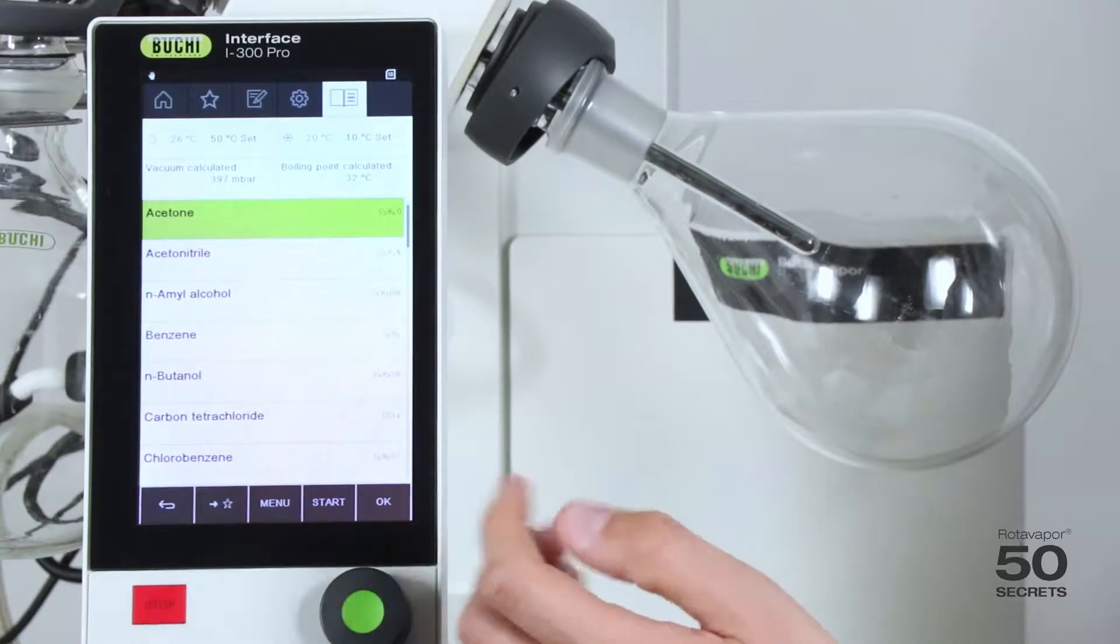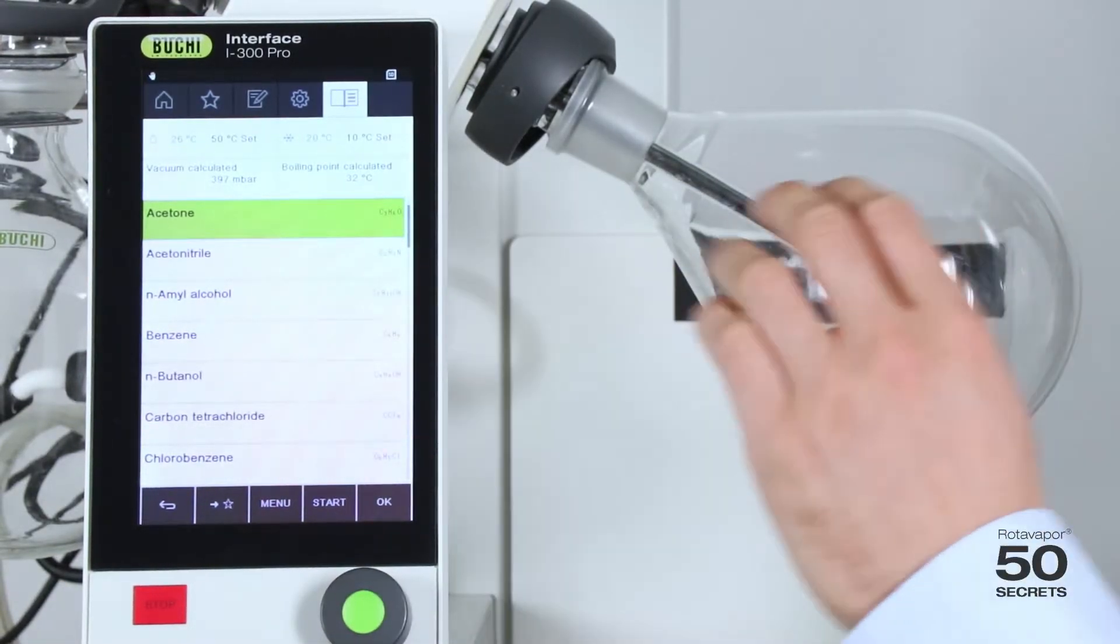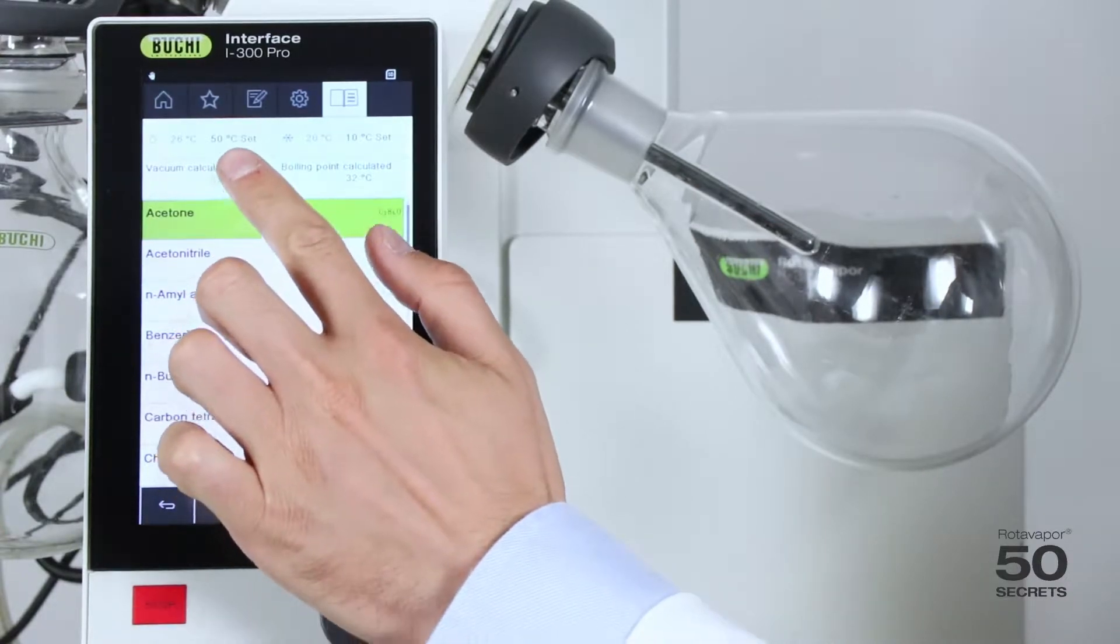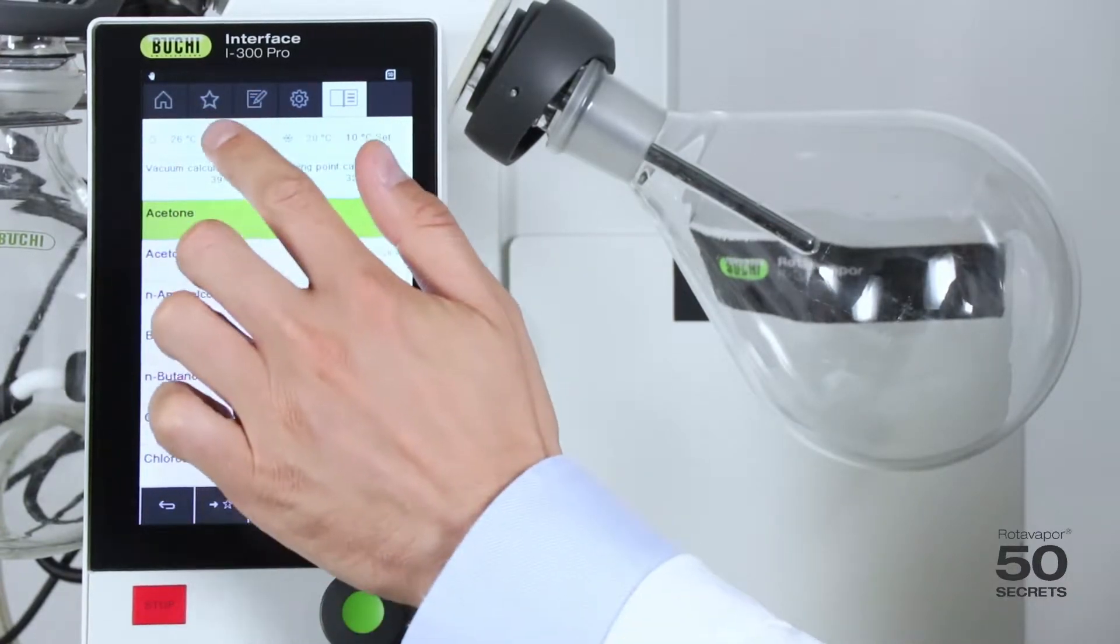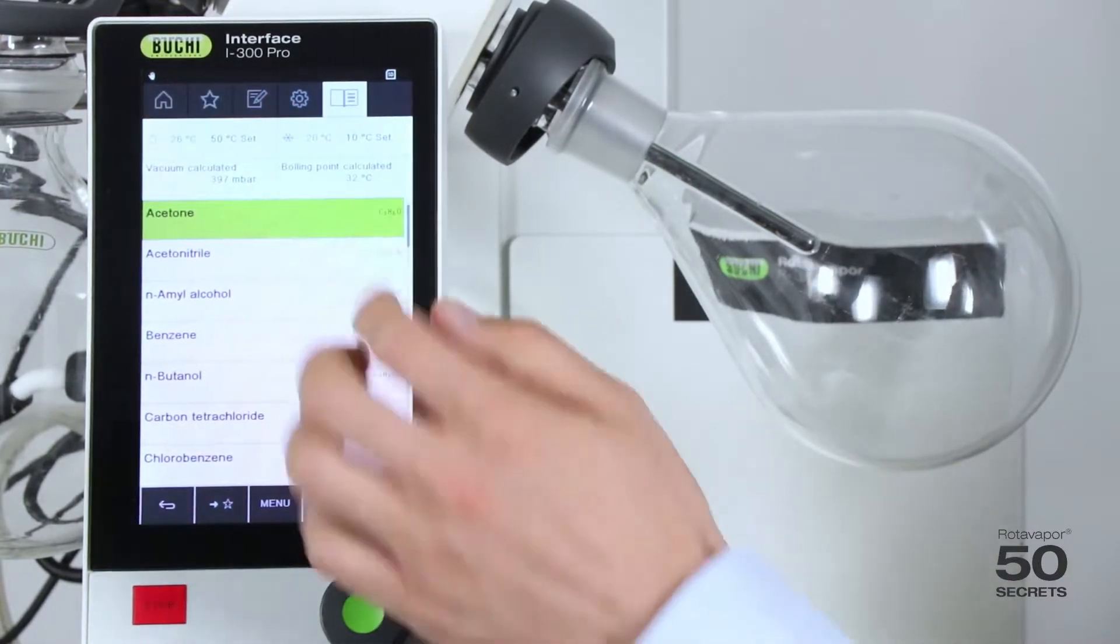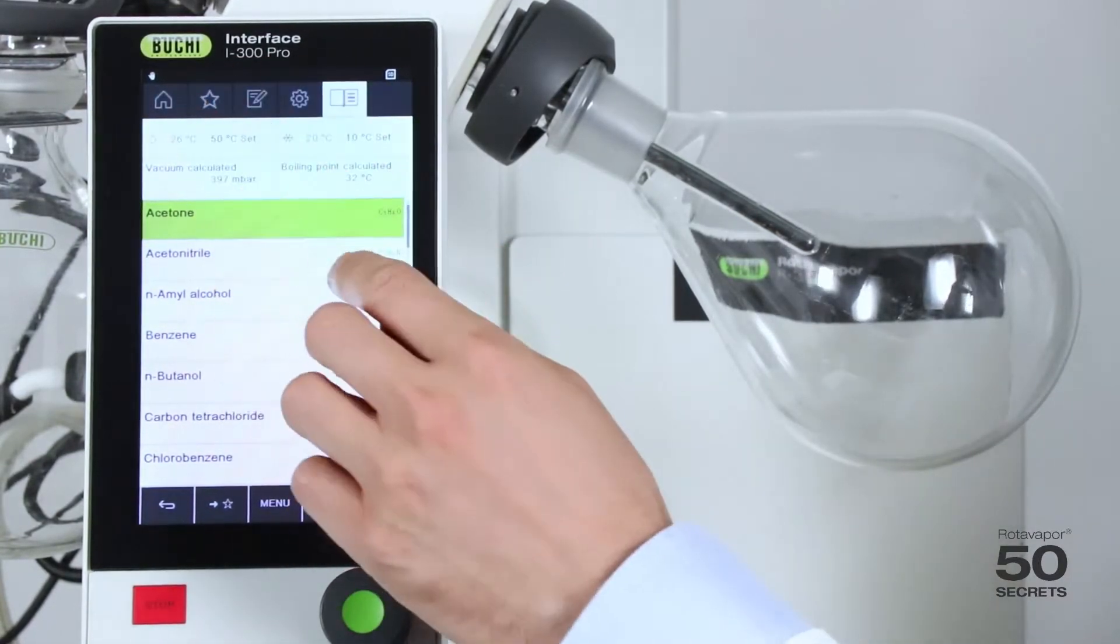Let's have a look at acetone for example. First we look at these two numbers over here. One is the heating bath temperature which is taken from the heating bath directly. So if the set temperature of the heating bath is 50 degrees it shows 50 degrees.